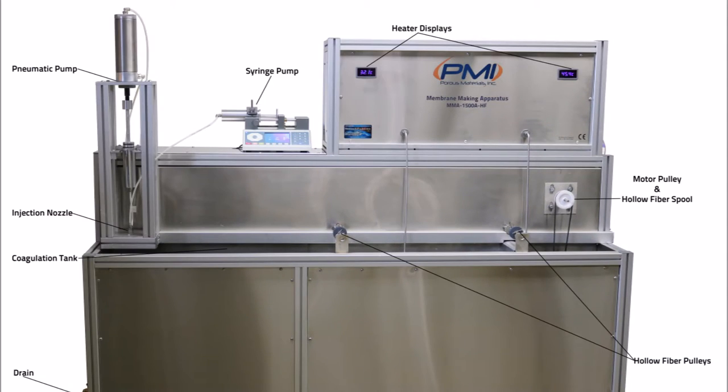Here we have a basic layout of the machine. From left to right we have the pneumatic pump, injection nozzle, coagulation tank, drain, syringe pump, heater displays, motor pulley and hollow fiber spool, and the hollow fiber pulleys.